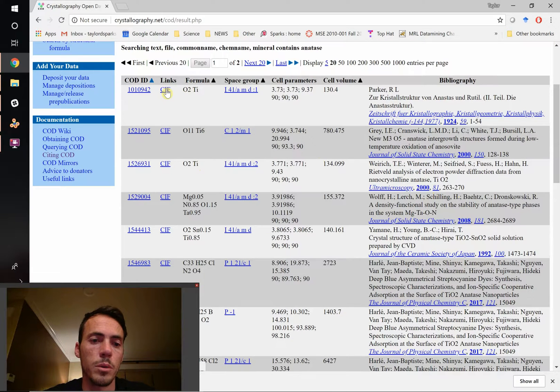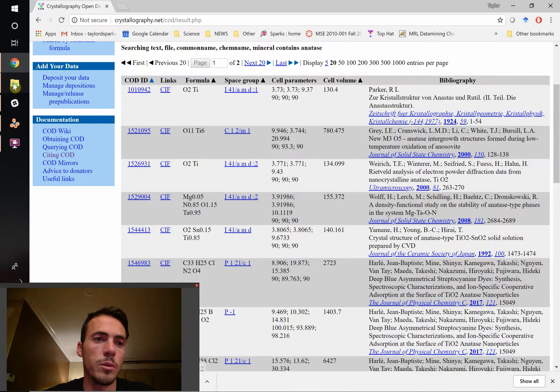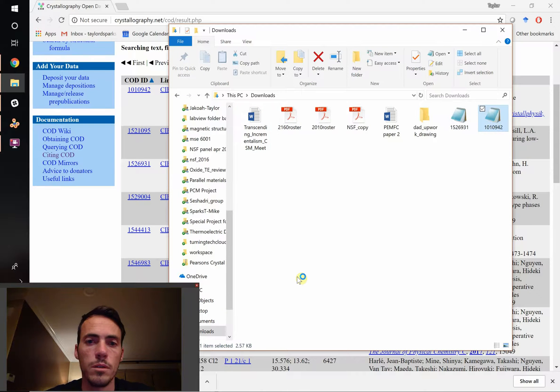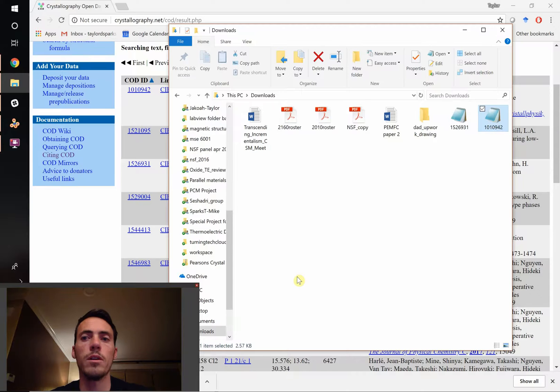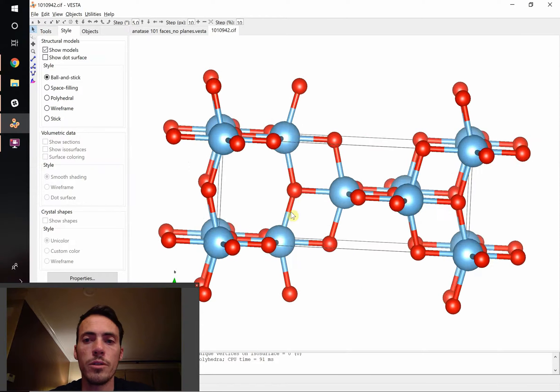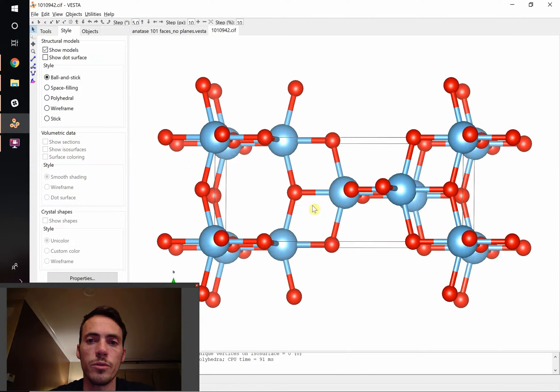We'll go to where they're downloaded in our download folder. Okay, it's going to fire up in VESTA. And here's our crystal structure for anatase.